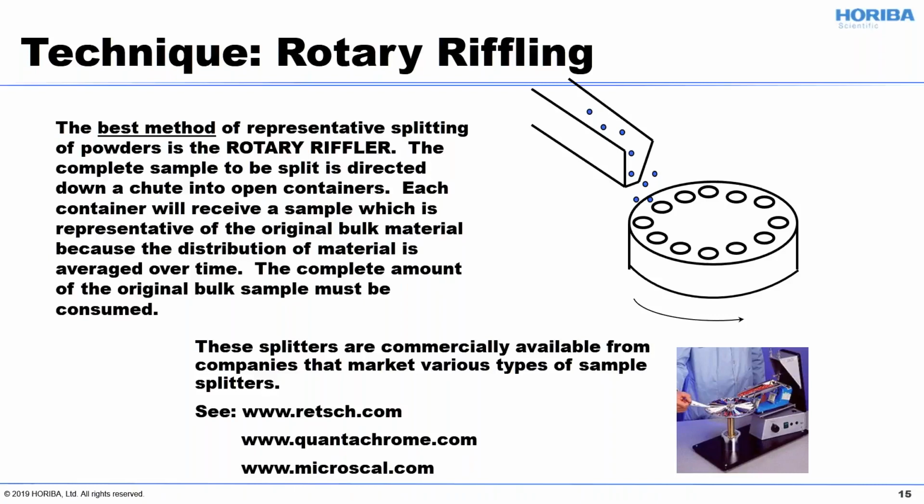So, things to remember: when you put particles on the hopper, you run through everything on the hopper until it clears out, because if the big ones are stuck in the back, you want to make sure they have their turn being split up between the small containers. Companies that make these include Fritsch, and Quantachrome as well.